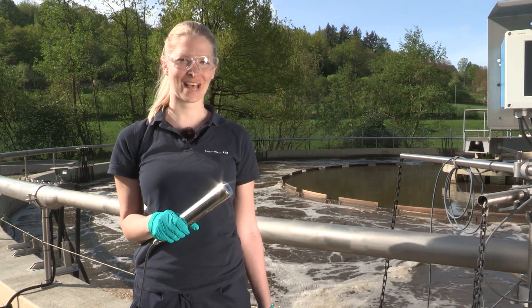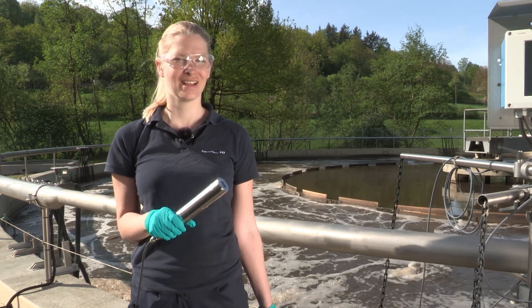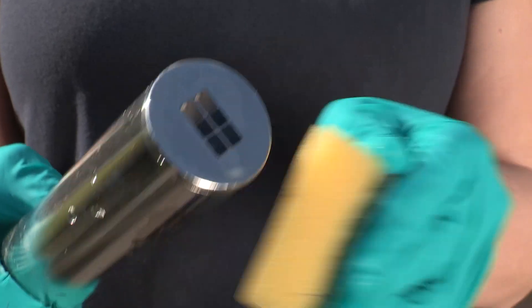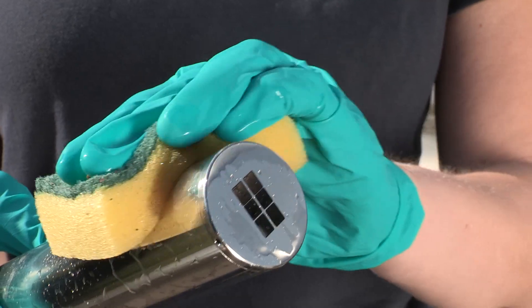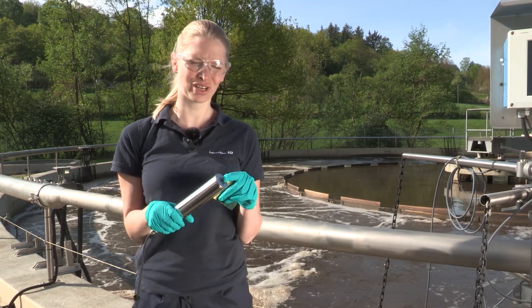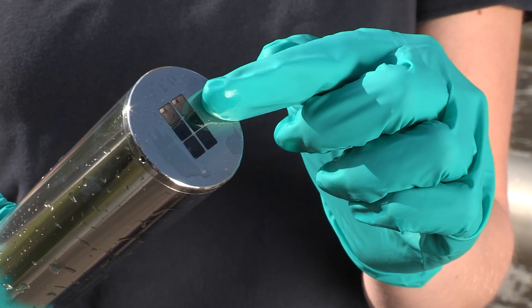After preparing the samples, we need to prepare the sensor as well. Therefore, we take a soft brush or a sponge and clean the sensor with water. While doing so, never touch the optics with your fingers as you will leave oily marks on them, which will affect the measurement.